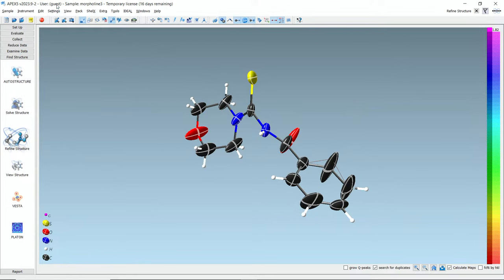So now we're going back. Remember when I indexed that unit cell in the beginning that didn't fit, it's 5. Remember the Q vector was about 0.4. In order to hit that by making the unit cell larger, we have to go to 0.2 to be able to hit the 0.4. 0.2 will be missing. But I integrated this with that superstructure.